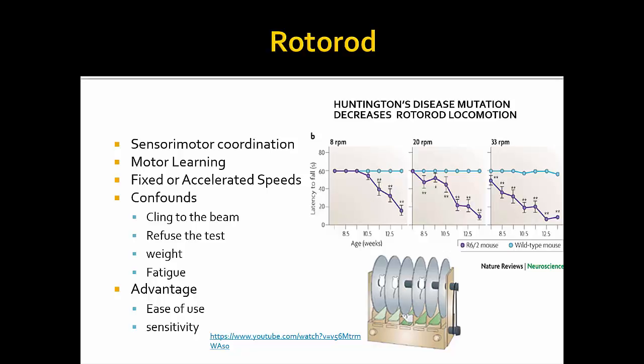What we noticed is that prior to injury, they all did that. There was no real issue with them doing that. Now, some of them were kind of like, well, I'm not going to do this, I'll just walk right off and fall. And that's what they did. So you can't obviously use that animal. Either he's too smart for us, or... He was, yeah. Some of them are quite smart.